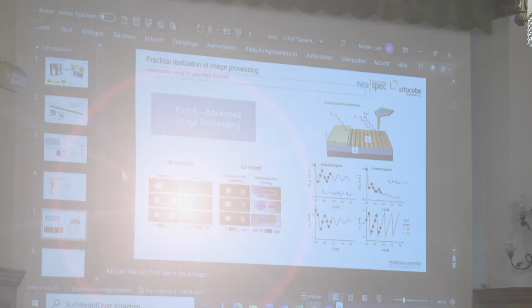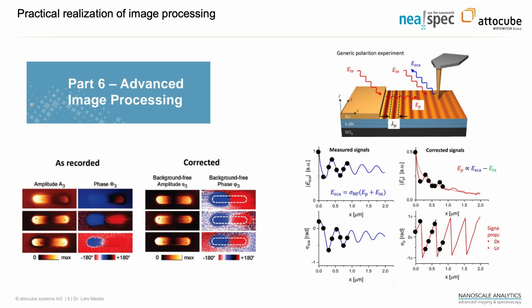And now, this was the last part, and actually, this is something that applies mostly for plasmonics and for field mapping, polaritons. And this is something that I actually didn't work so much with. That's why I didn't really pay attention to it. But I noticed from Martin's talk it's really important, and it's really a limitation of Gwyddion.